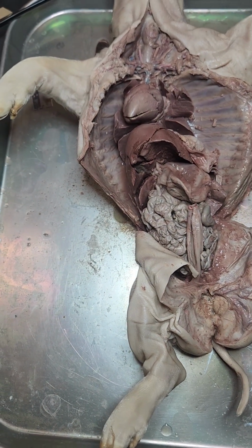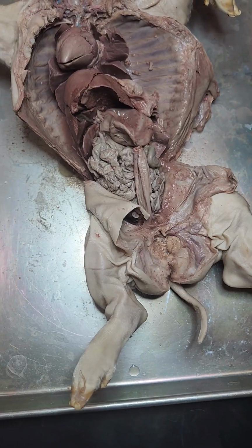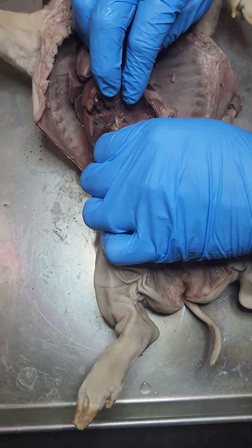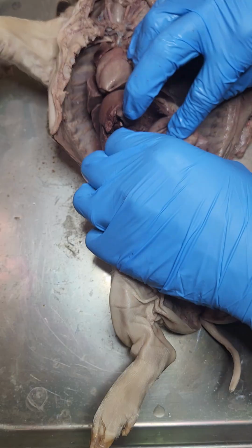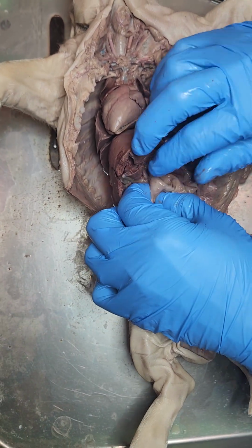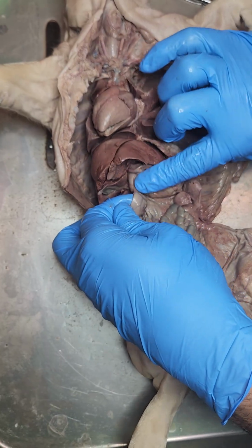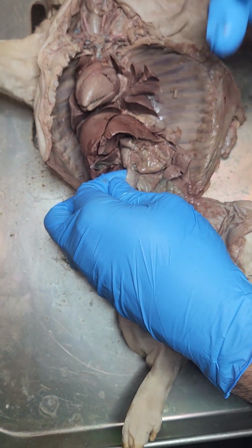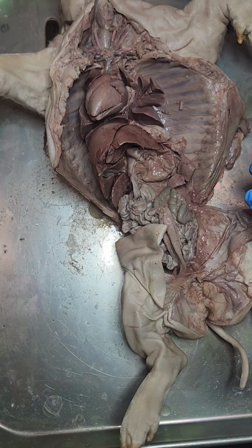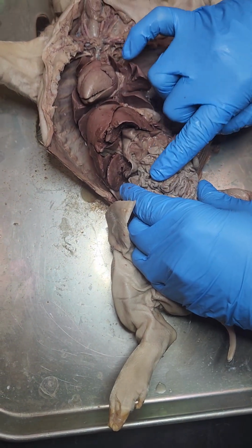Duodenum or duodenum, depending on how you want to pronounce that, is the very top portion of the small intestine. So how I find it is I find the stomach and I find this hard nodule. This hard nodule is the pyloric sphincter. Right below it, this first loop right there, that's the duodenum or duodenum. It's the very tip top of the small intestines. Small intestines are all right here. So those are all small intestines.